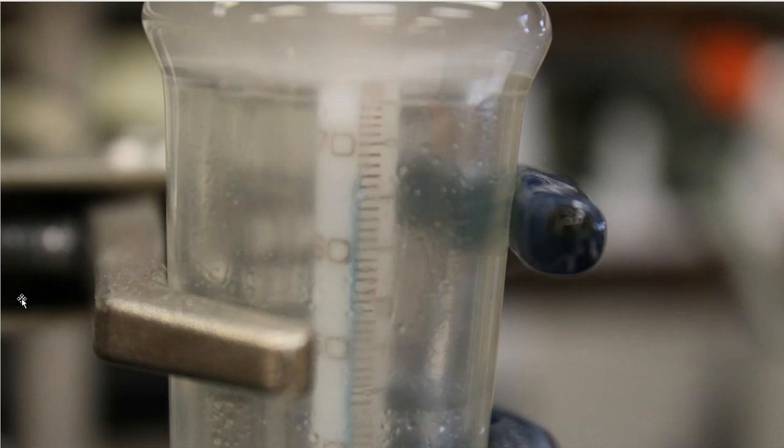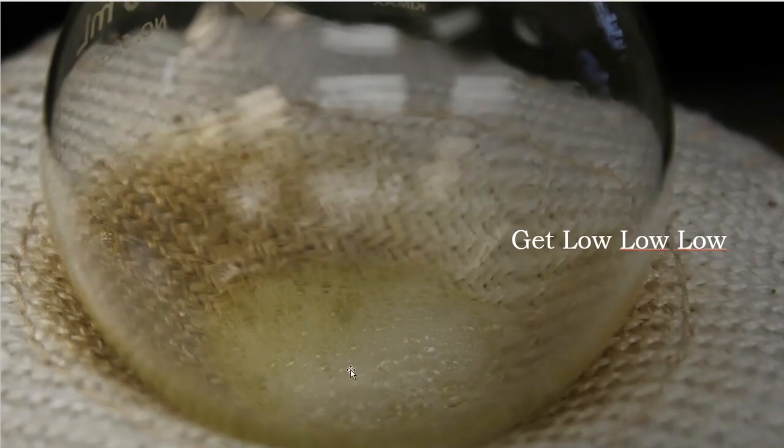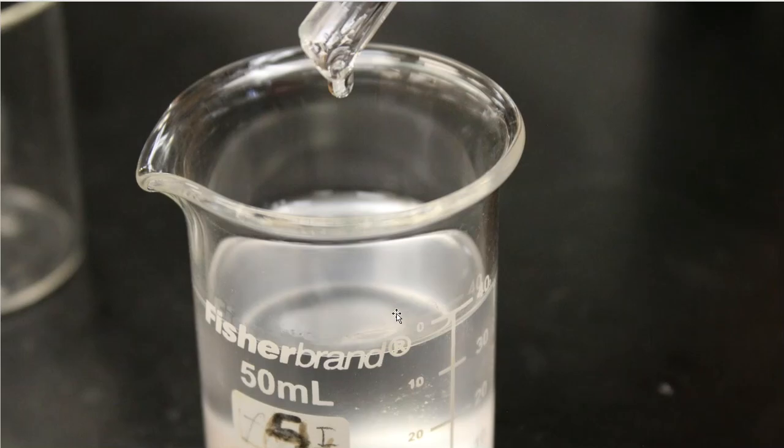All right, so as this begins to distill over, it did get up to 67. Look at this, 65, 66, 67. So I did feel a little bit better about this thermometer, but this was after pretty much all of the THF had boiled over. That's how long this thermometer lagged behind the actual vapor temperature coming off. All right, so over on my receiving side, folks, look at this. I've almost filled up my 50 mil beaker, and all of that is going to be THF, every single bit of it.